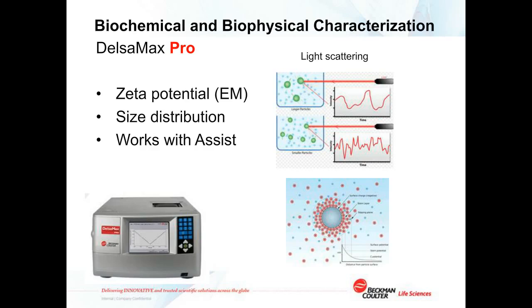So typically, as you're applying a potential to a solution that has salt, the electric current will generate bubbles. And because bubbles scatter light, they interfere with your ability to collect zeta potential measurements.